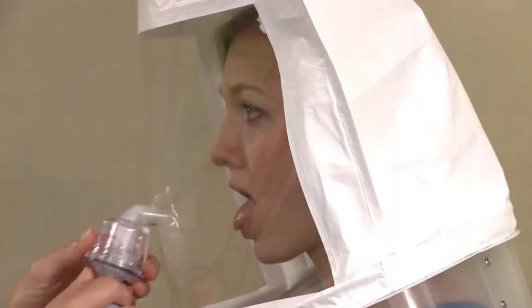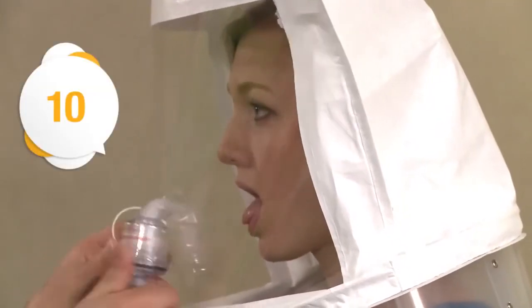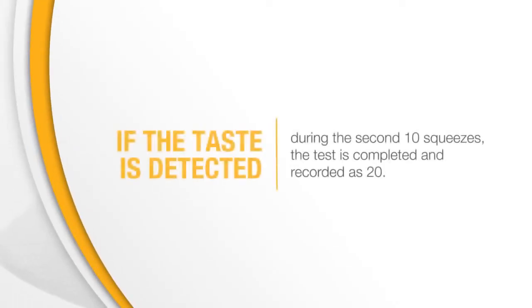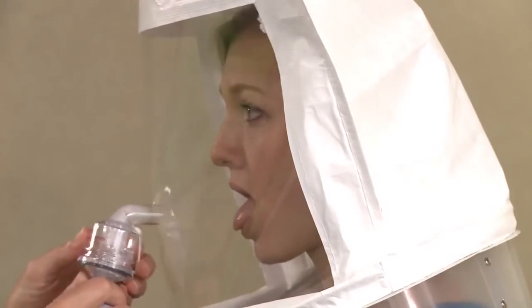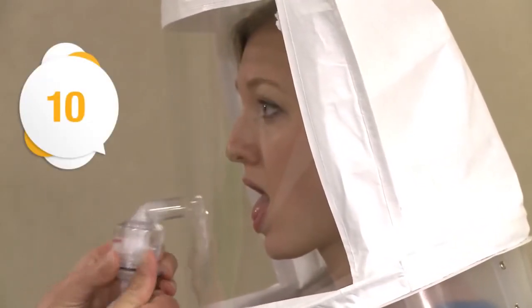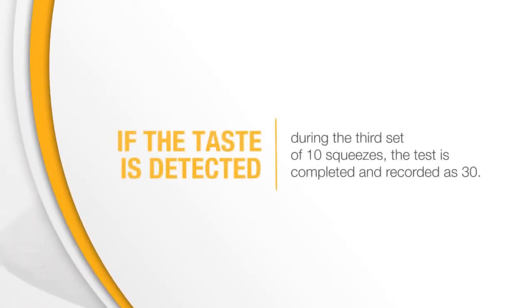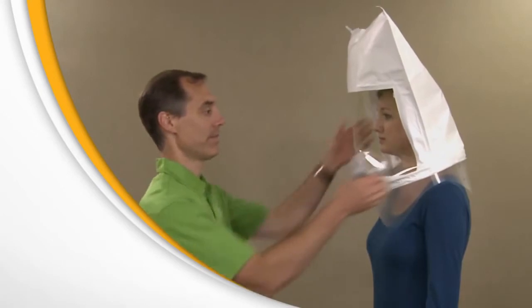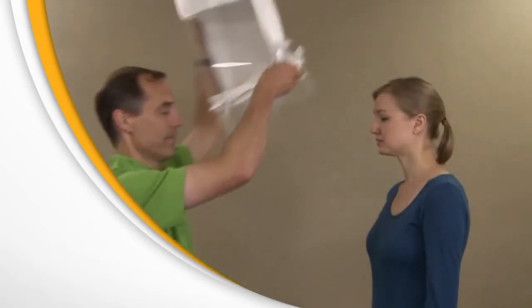If you can't taste the test agent after 10 squeezes, the instructor will put an additional 10 squeezes into the hood. If the taste is detected during the second 10 squeezes, the test is completed and recorded as 20. If you still can't taste the test agent, the instructor will add 10 more. If the taste is detected during the third set of 10 squeezes, the test is completed and recorded as 30. If you still can't taste the test agent after 30 squeezes, the test is over. You can't be tested using this material.